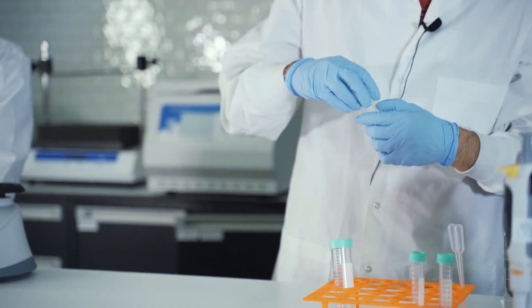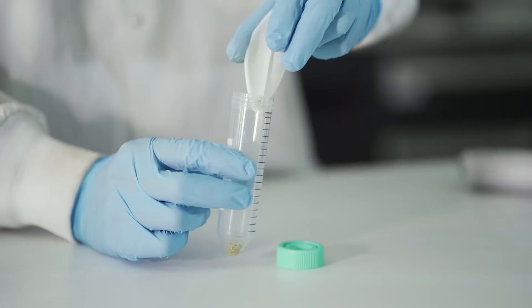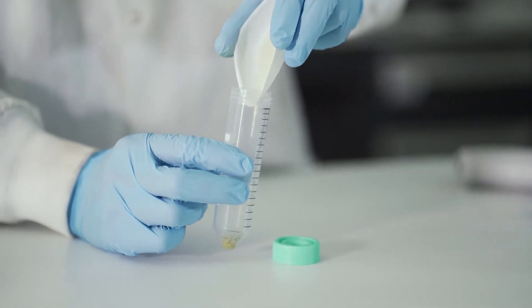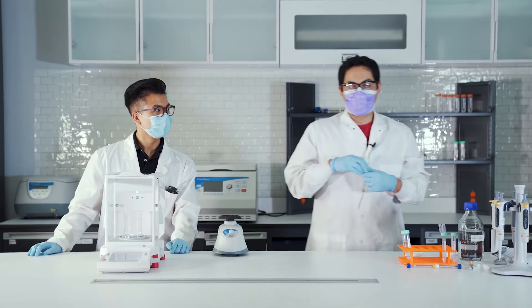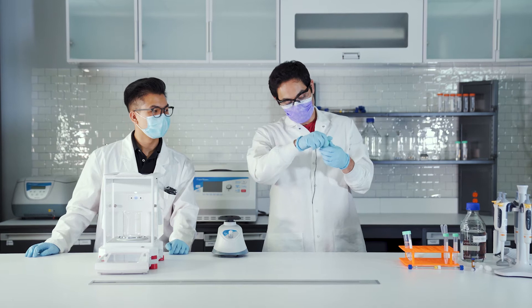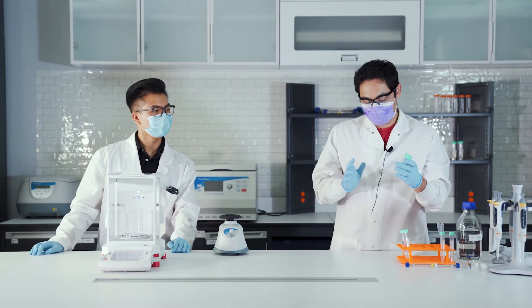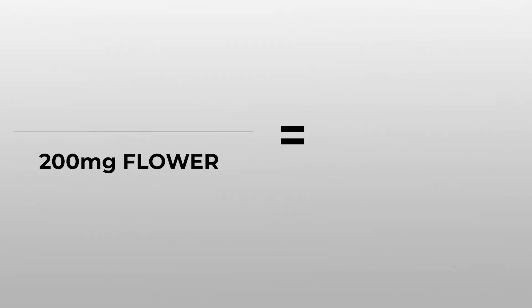Now we've tared it and the next thing we'd want to do is go ahead and add our 200 milligrams of sample in there. Then we're gonna dilute up to 20 mils of methanol for a 100-fold dilution. Basically, you have 200 milligrams. If you top it off up to 20 mils of methanol, then you've essentially diluted the sample 100-fold, so you made it 100 times less concentrated.